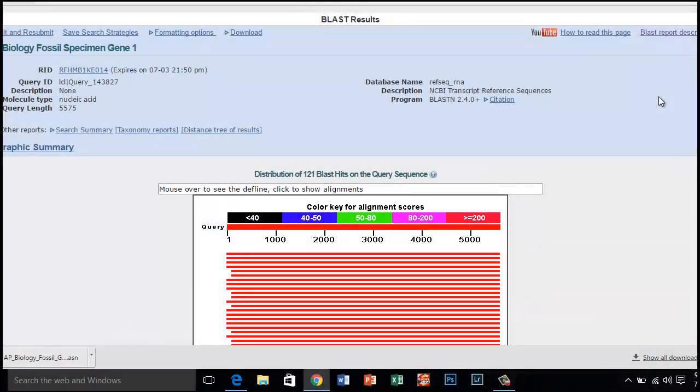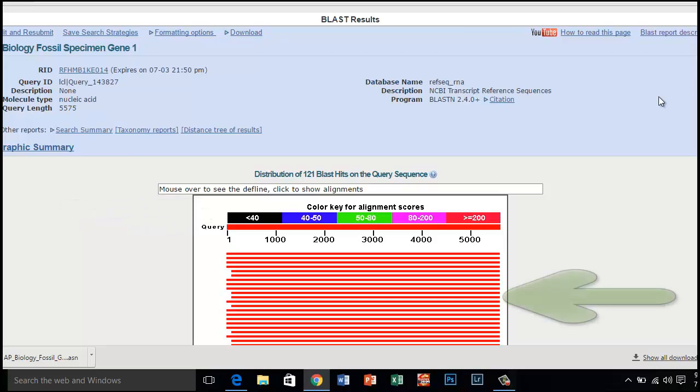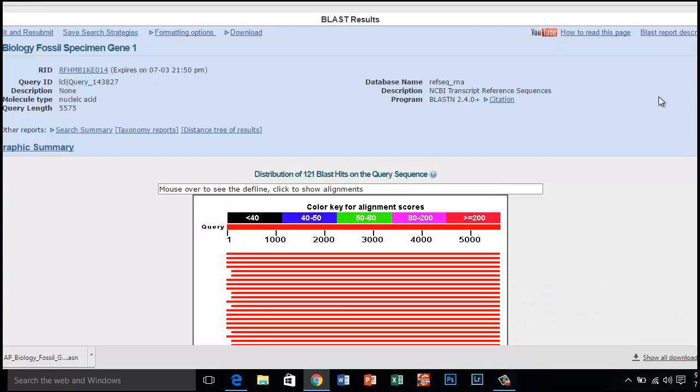The results page has two sections. The first section is a graphical display of matching sequences. The top bar represents the gene sequences you entered into BLAST. The red bars represent the top results in the query and how well aligned each result is with the gene of interest.